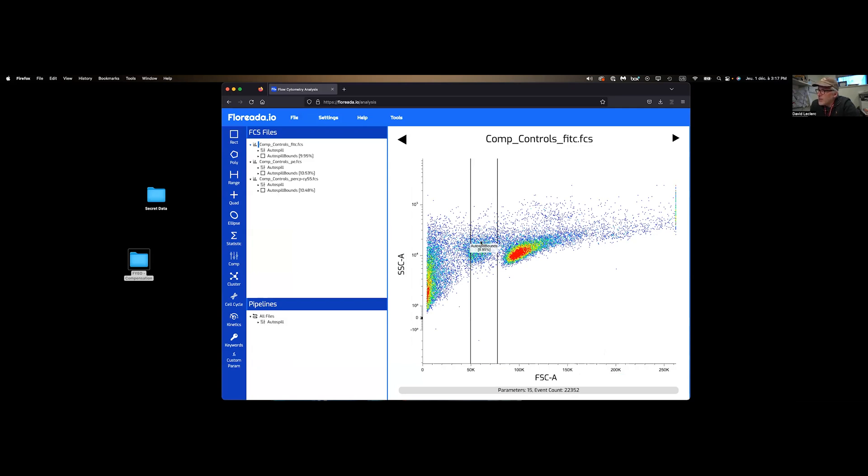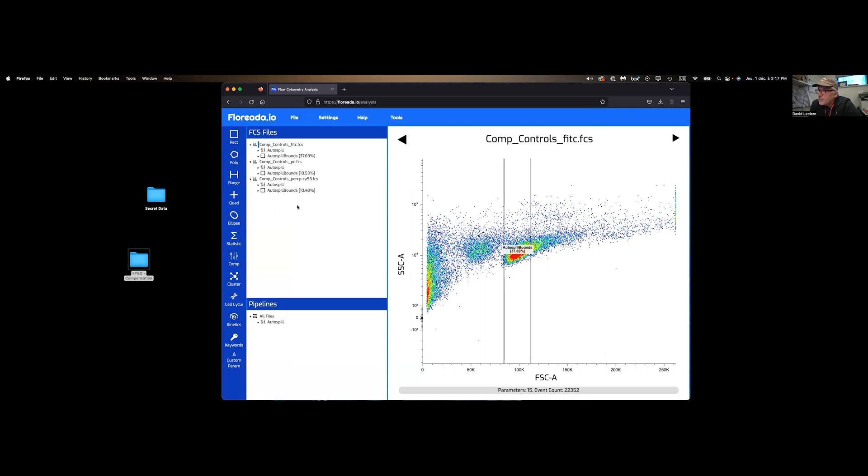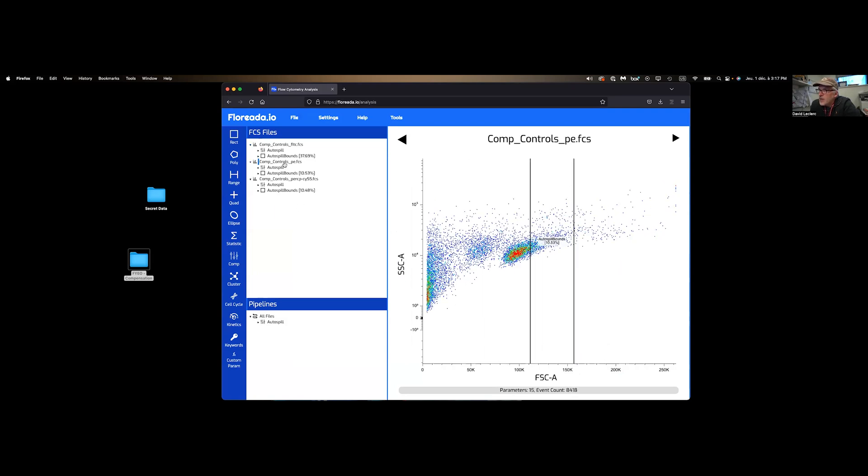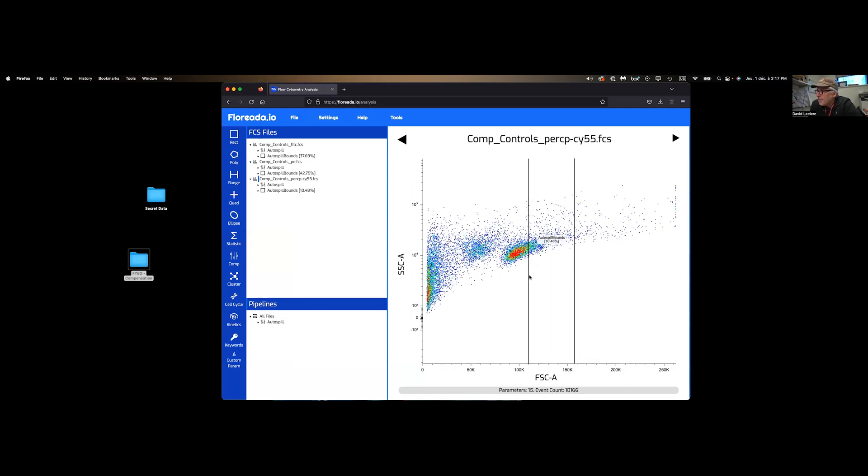However, the gates, the Autospill bounds are incorrect at this point. We want to gate on this main cluster over here, so you simply select your gate and move it around. We're going to do that for all of my parameters. After all this clicking, we're good to go.